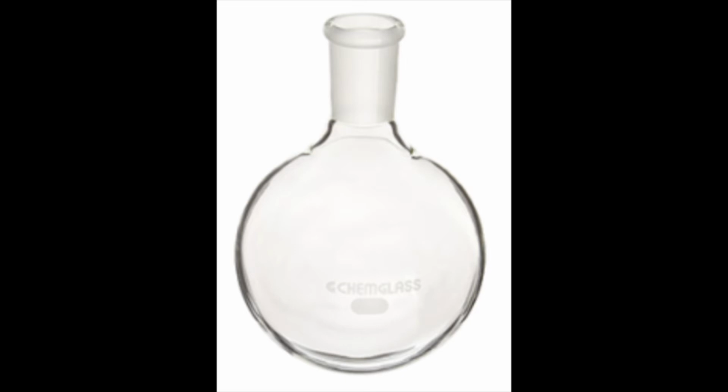Now grab a 100 milliliter round bottom flask. Transfer your spice into this round bottom flask using your filter paper as a funnel, and then add 50 milliliters of water and a boiling stone. Set this aside to soak for at least 15 minutes before you start your distillation.